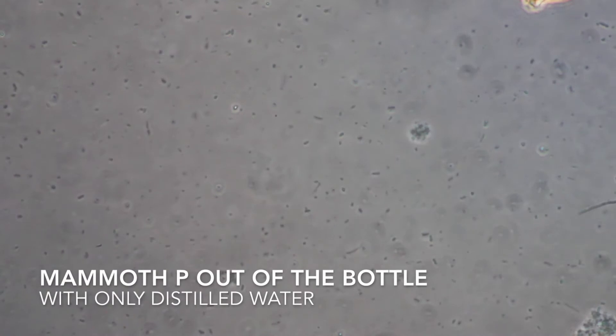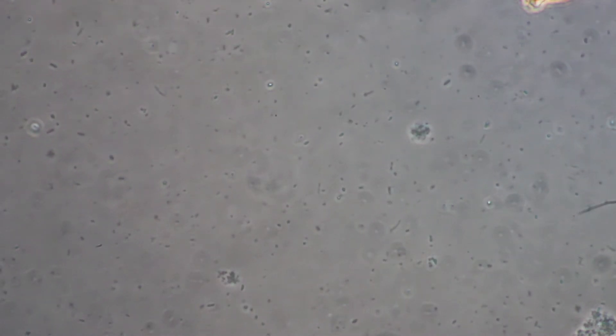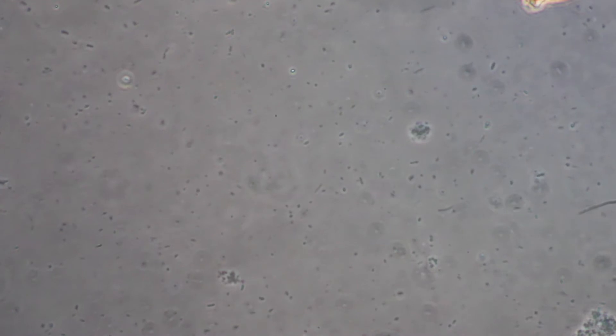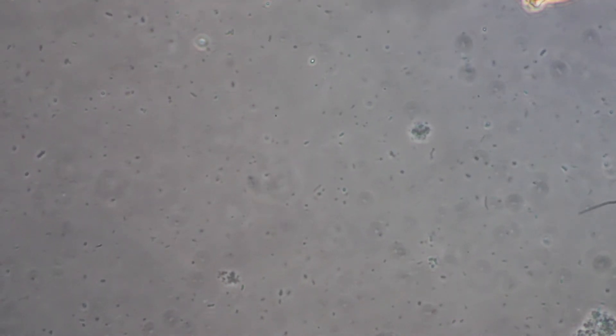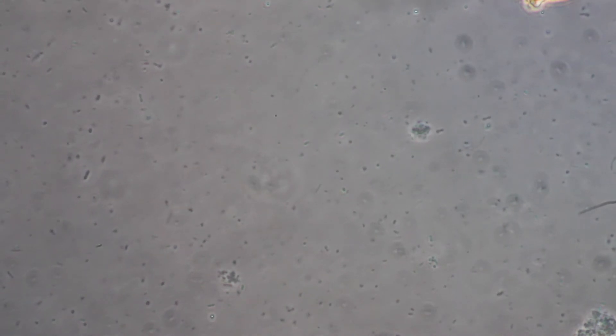Hi, this is Tad Hussey with KISS Organics. I'm here today to take a look under the microscope at Mammoth P and see if there are ways we might be able to extract and replicate some of these microorganisms to make the Mammoth P go a little bit further. We're going to mix some Mammoth P with a few different ingredients in distilled water and see if we can replicate some of these organisms.